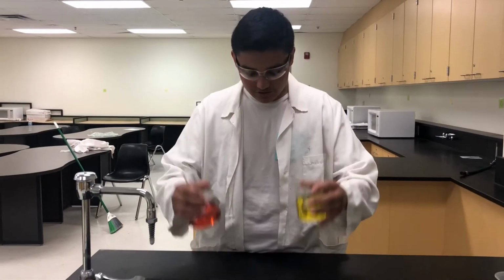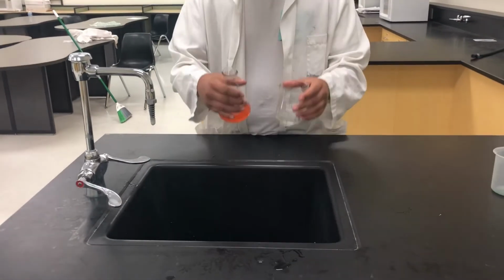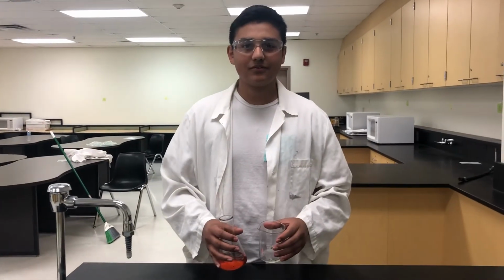I'm done with these chemicals. No, you can't pour those down the drain. Why not? It's damaging to the pipes.